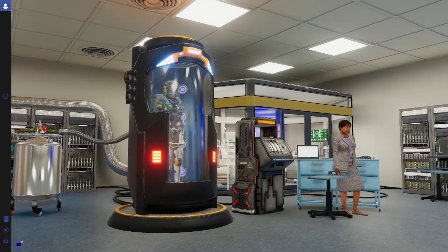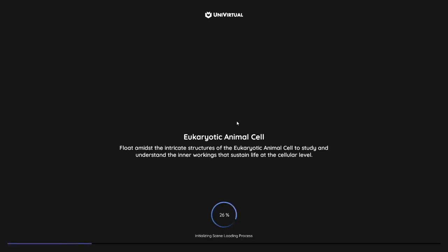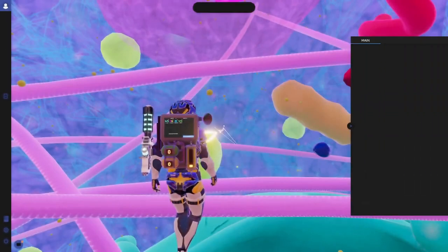So I know this lab has been pretty janky for you guys. Personally, this lab has taken the longest for me to figure out, an hour and a half, compared to the usual, which is around 30 minutes or less for me. It took me so long to figure everything out because at the beginning it was like holding your hand, guiding you through everything, and suddenly it just drops you off.